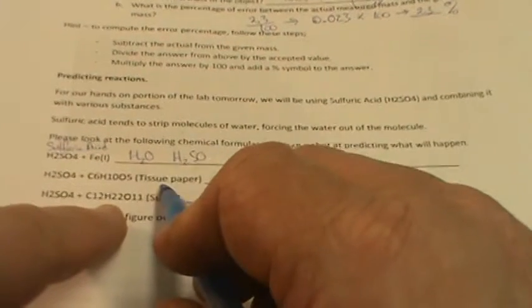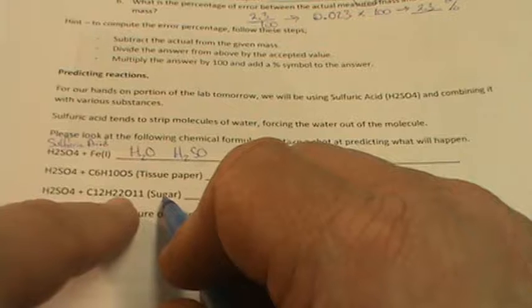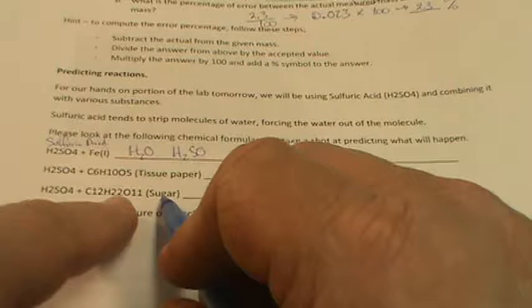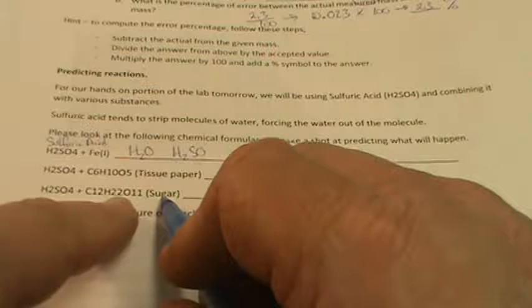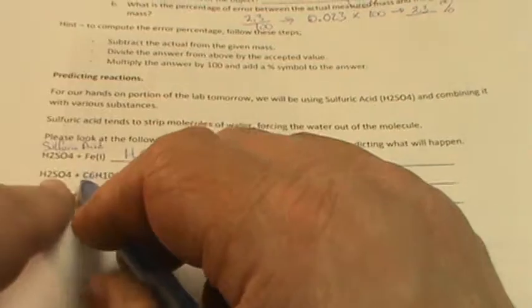Now notice we're going to do tissue paper and sugar. The sugar one is already posted on the page, and it's labeled as acid sugar number 1 and acid sugar number 2. I did it twice. Once I did it as a test run to see how well our hood worked in there, and the other time I did it for some students who came in this morning. So, here we go with the tissue.